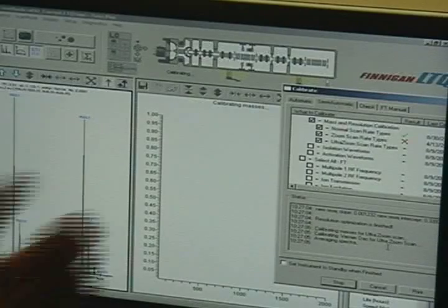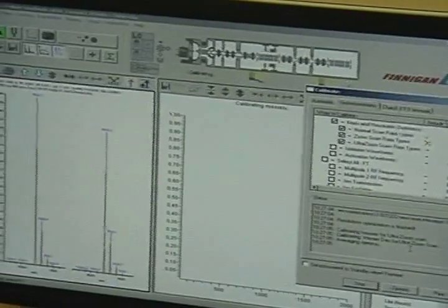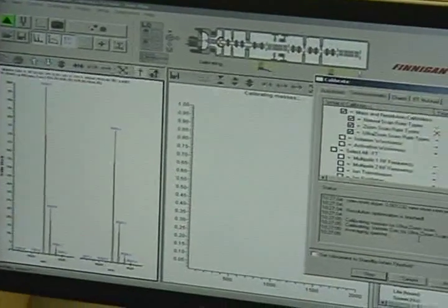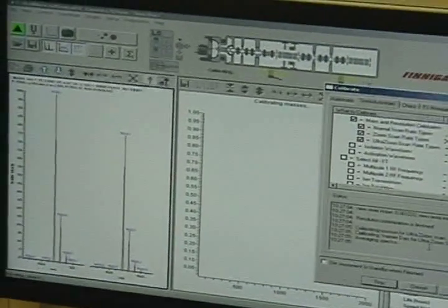I want to see if I can get a data set of yours, if you don't mind. Sure, I'd love to help and convince Brayman that the code doesn't work. If the peaks are really low abundance and there's no charge state distribution, it should have skipped those. But then if it were to skip them, we'd miss that phospho optimize.